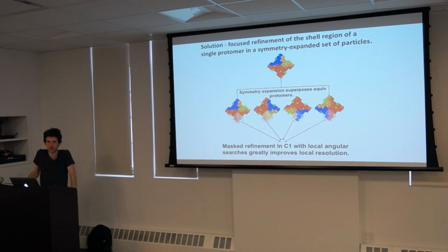Do you guys think there's any route to real atomic resolution Cryo-EM? Need better samples. Yeah, it's all the user's fault, right? Yes. Because theoretically, we can go below half an angstrom. Does the camera do that, I guess? We would have to have major upgraded hardware to go easily beyond that. Well, in that case, once we routinely get 1 angstrom or so, then for sure we can update those databases.